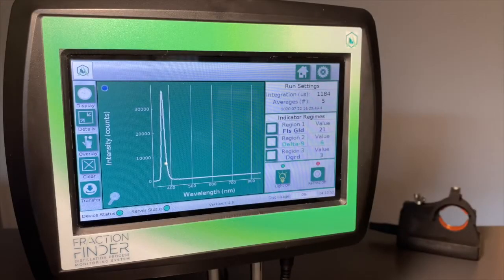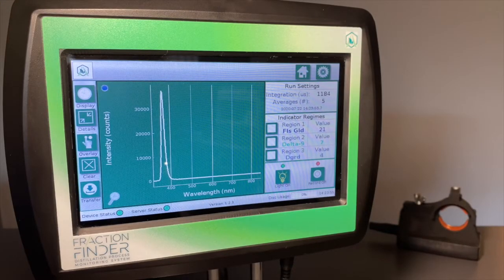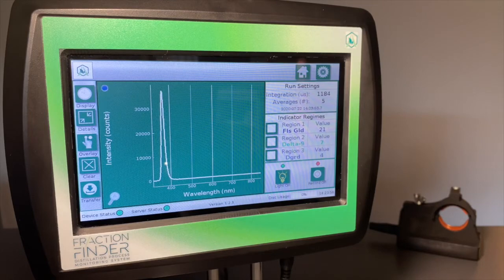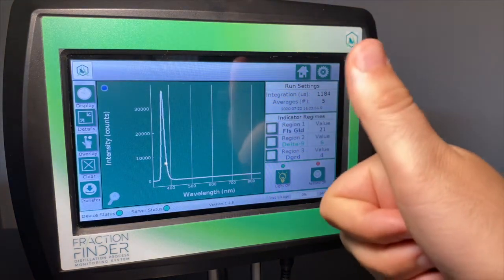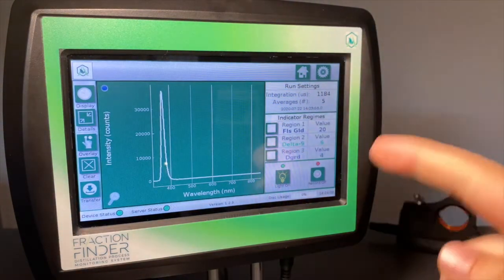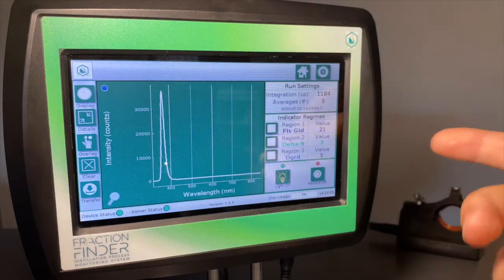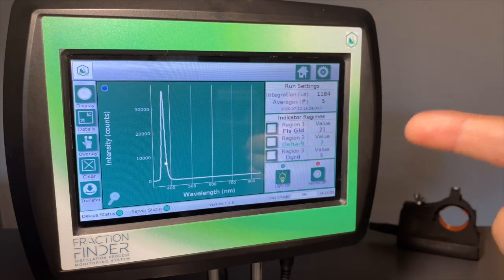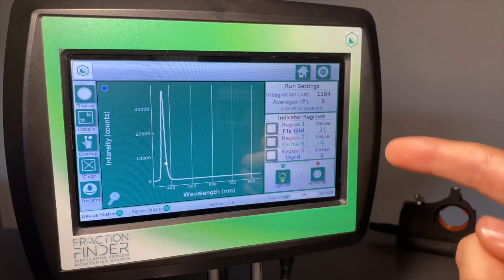So this video is going to go over setting you up for success so that you can successfully track CBD or track Delta 9 and really get the best most precise separations possible.